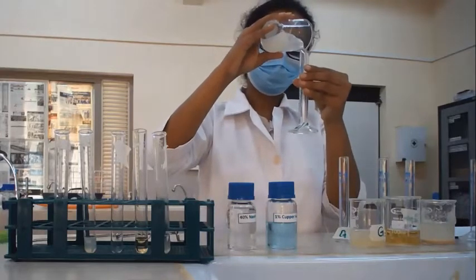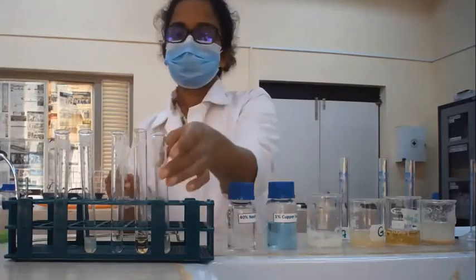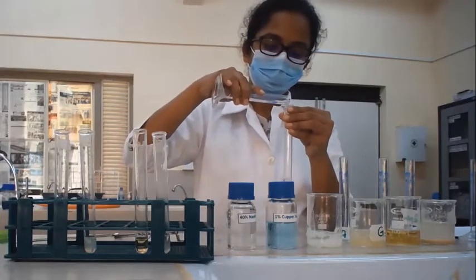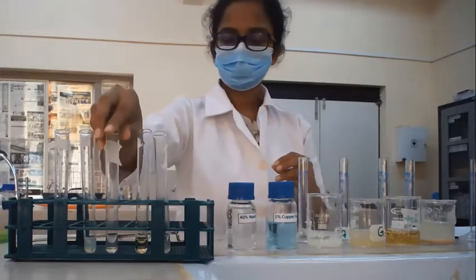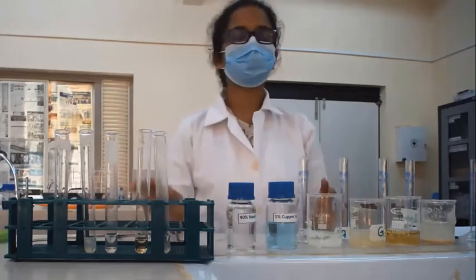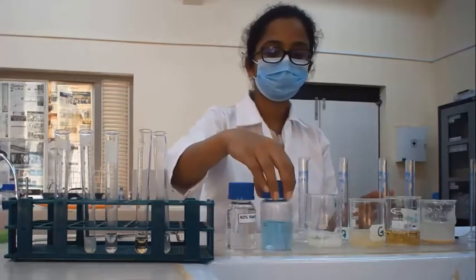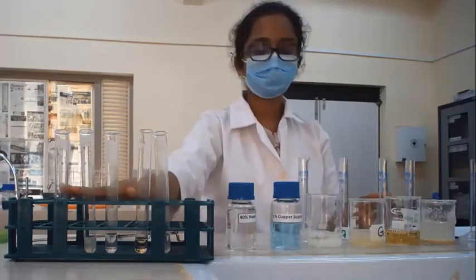3 milliliters from the egg albumin. Next, we are going to add a few drops of copper sulfate solution into each of these test solutions.